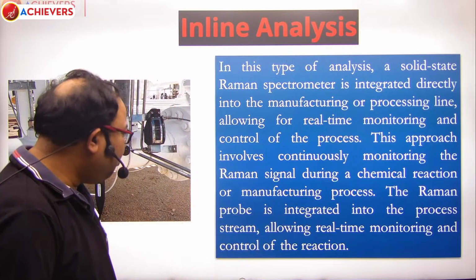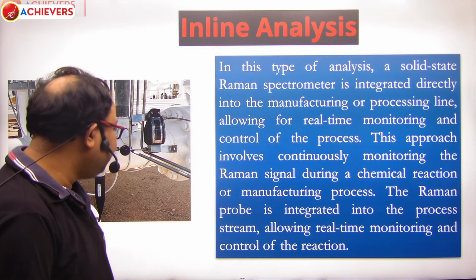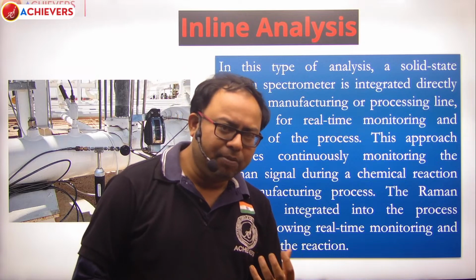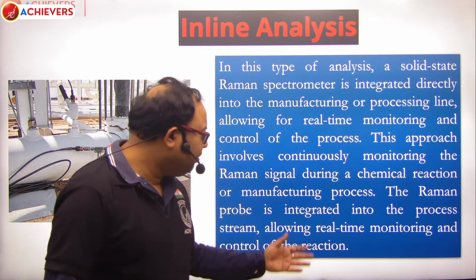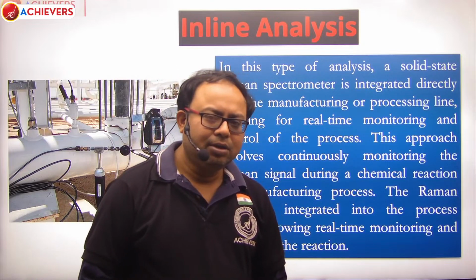The Raman probe is integrated into the process stream, allowing real-time monitoring and control of the reaction. You have a Raman probe that is infused within the system, and that allows real-time monitoring and control of the reaction. So that's how it works. Okay.